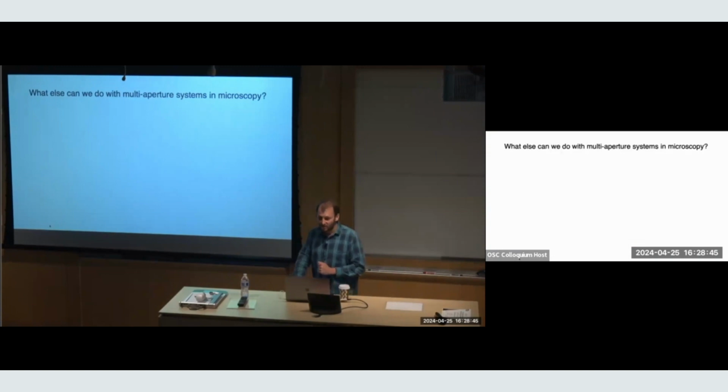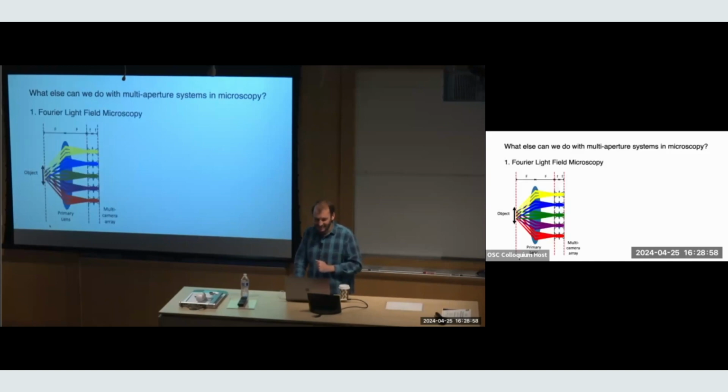Okay, so for the last 15 minutes, I'm going to show more of the not direct imaging, but the multi-scale type imaging, or just playing around with camera arrays optically. So one of the designs we were interested in is something called a Fourier light field microscope.